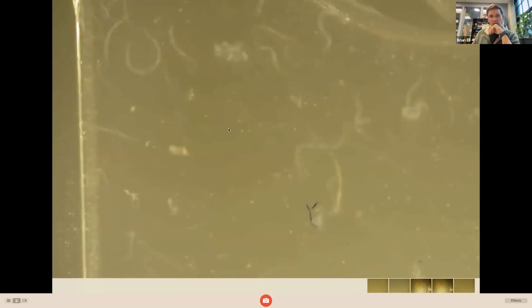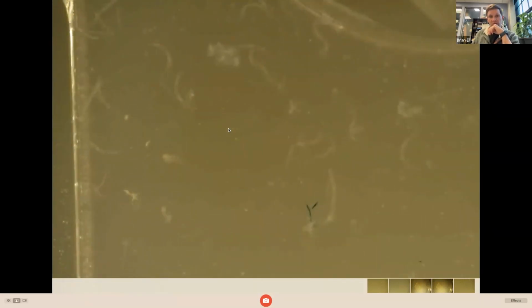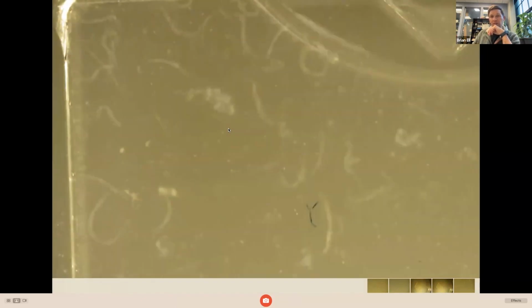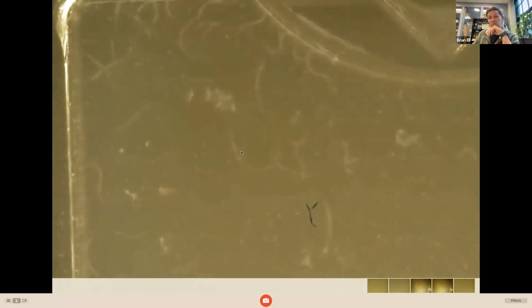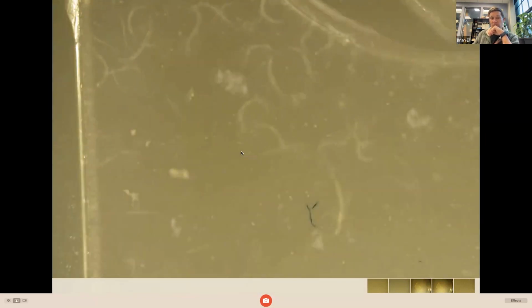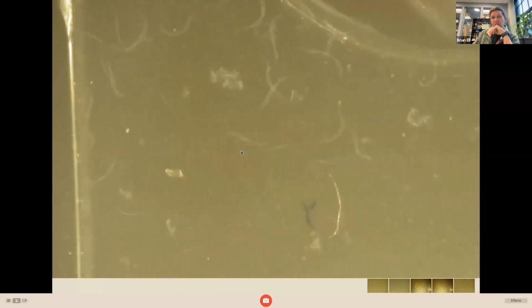Any of these would be a good candidate. We are looking for basically just picking only one. If you have a microscope with a screen where multiple students can gather around and observe at the same time, you could have them each count one worm on their own. Otherwise, you can have students take turns counting at the different time points, whichever works out best for you.